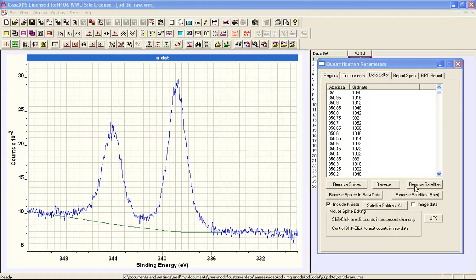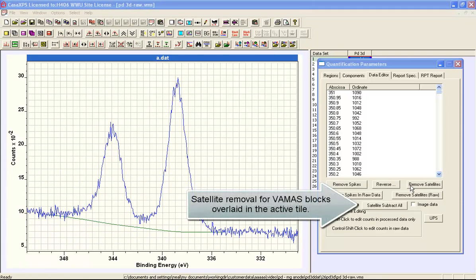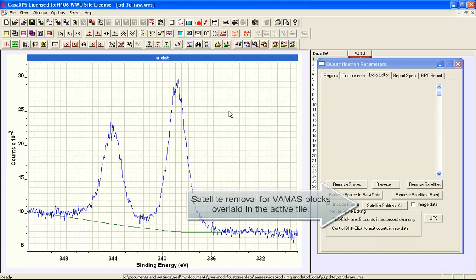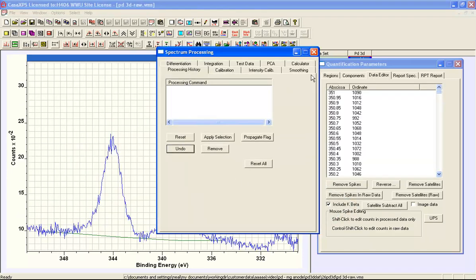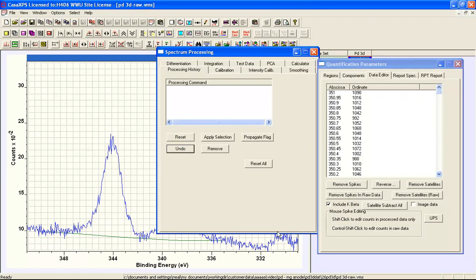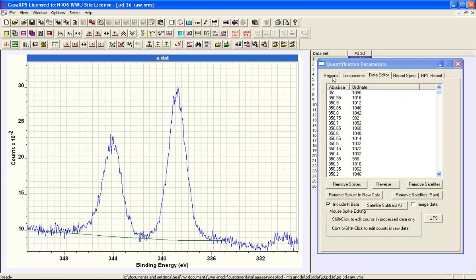Remove satellites removes the satellites from the processed data only. The raw data is still in the original state so we're able to undo these operations using the undo button on the spectrum processing dialog window. So we have the satellites returned here.